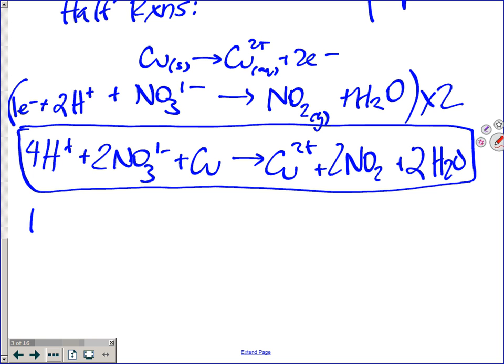So 1.5 grams of brass, aka the copper that we're assuming. I want you guys to figure out how many milliliters or liters of the nitric acid solution we need. Stoichiometry, go. Now, that 1.5 grams we're just using as a placeholder for now. We'll go back and recalculate with the actual mass.